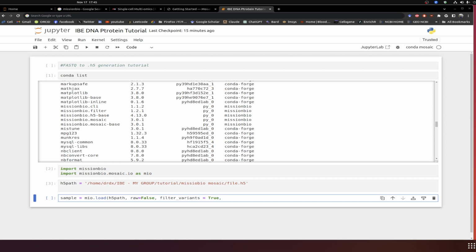That's a very interesting part. So the next part is single equal to true. So we set single equal to true.